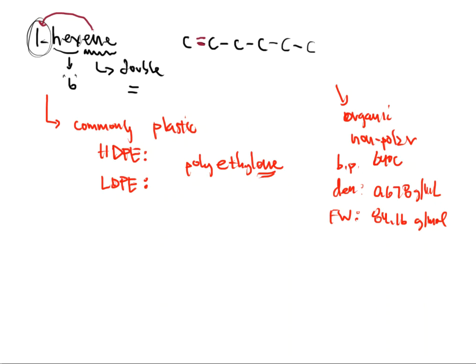The next reaction that we're going to talk about, or not the next reaction, but the next reagent that we're going to talk about is sodium borohydride. This is the other component that you're going to add to the hexene in order to get it to do something. So sodium borohydride, what can we say about that? Well, sodium is Na, right? We know that. Borohydride. Boro is for boron. I can kind of see that element name in the actual chemical name. And hydride is basically hydrogens.